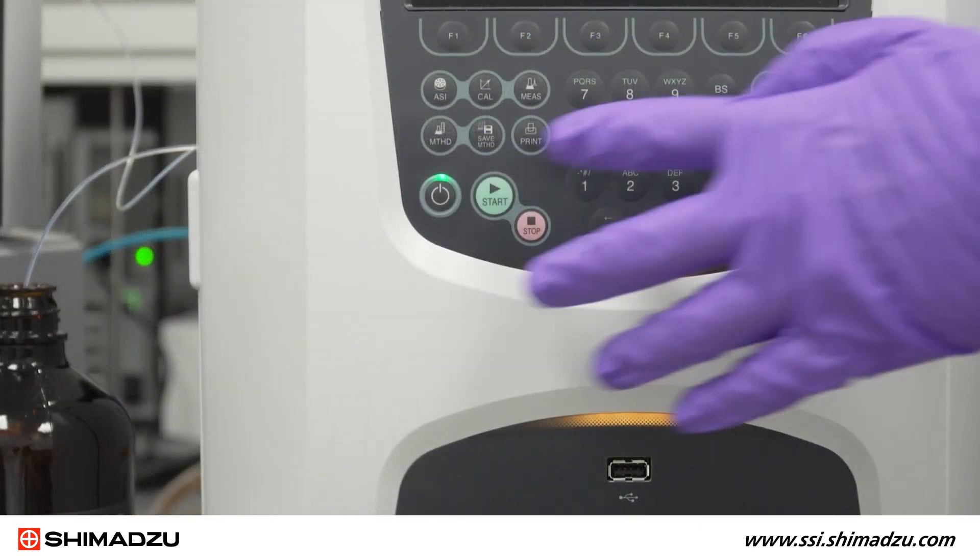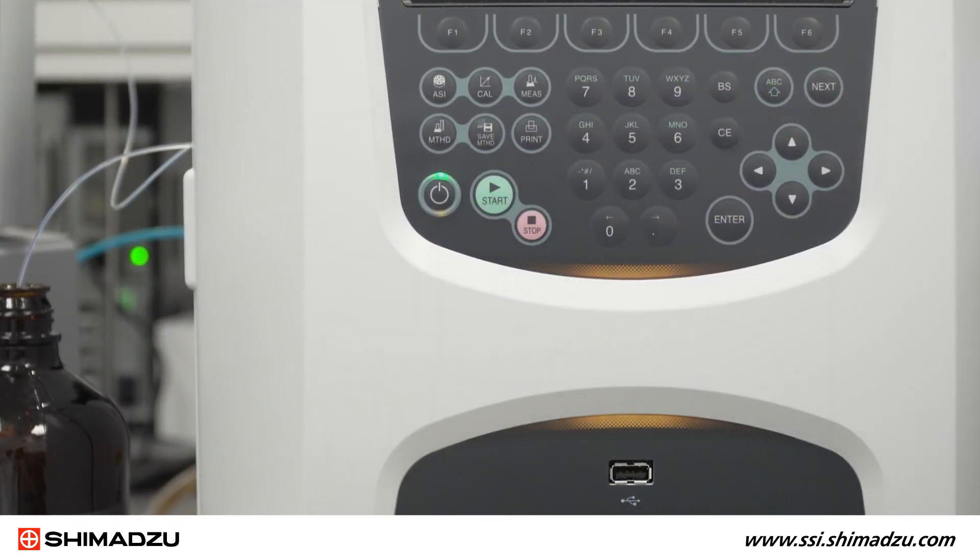Before beginning this procedure, make sure the instrument is turned off and that the furnace is not heated up.